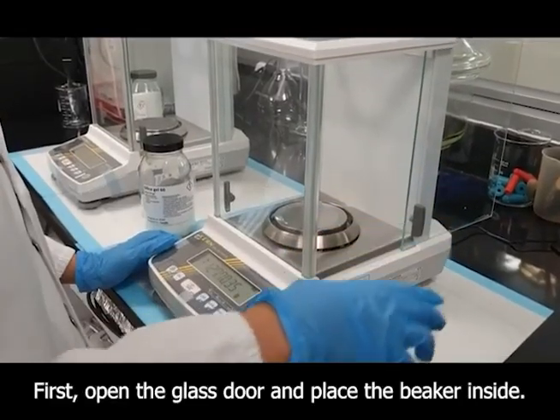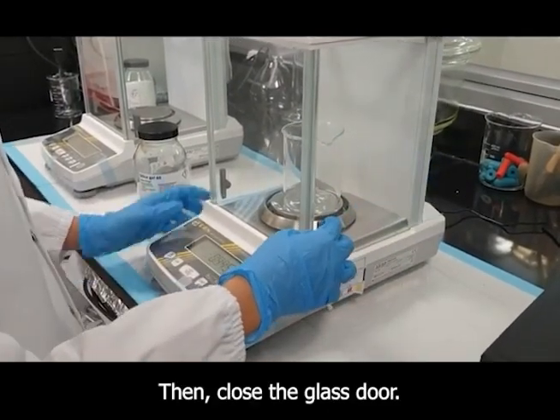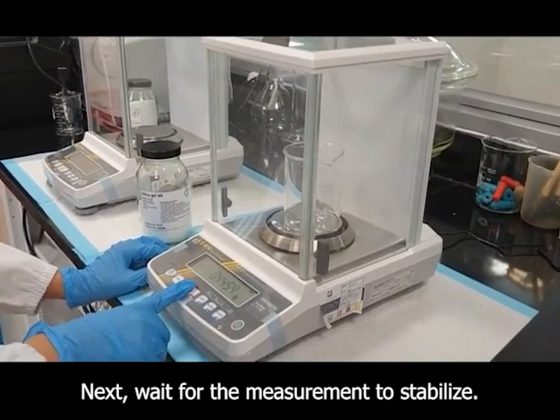First, open the glass door and place the beaker inside. Then, close the glass door. Next, wait for the measurement to stabilize.